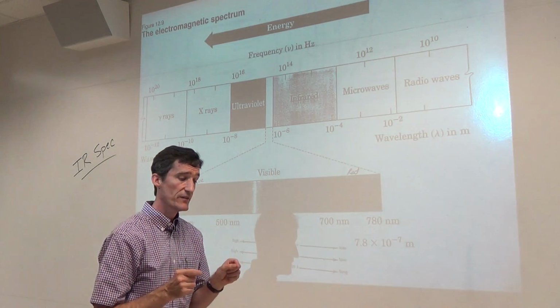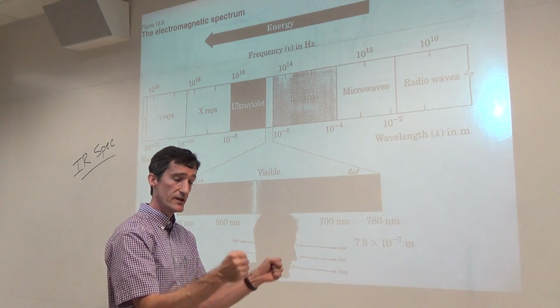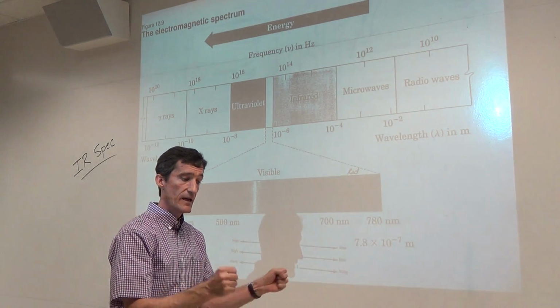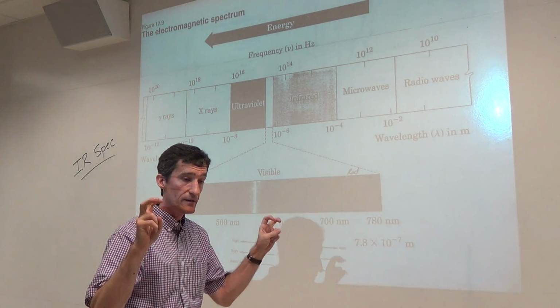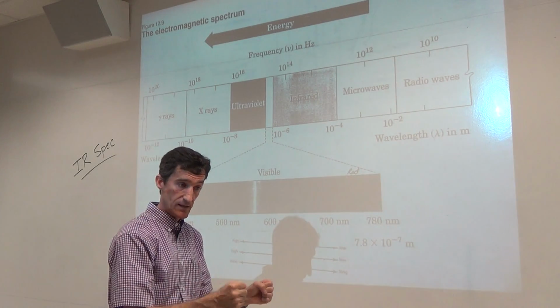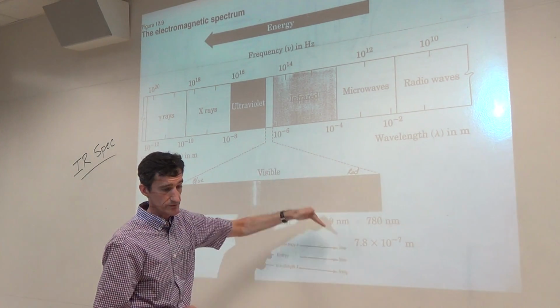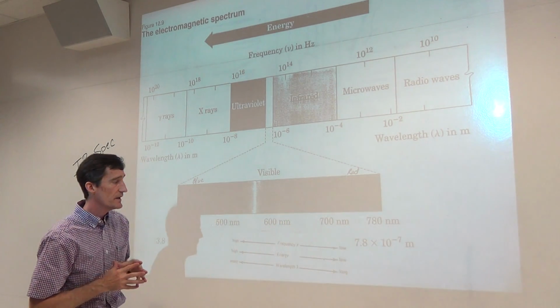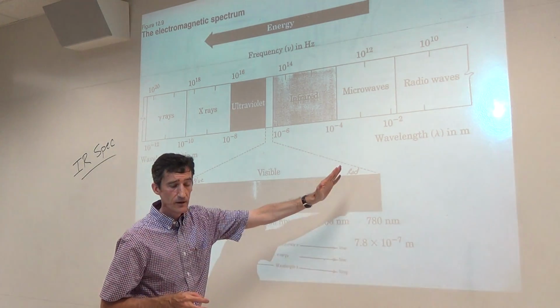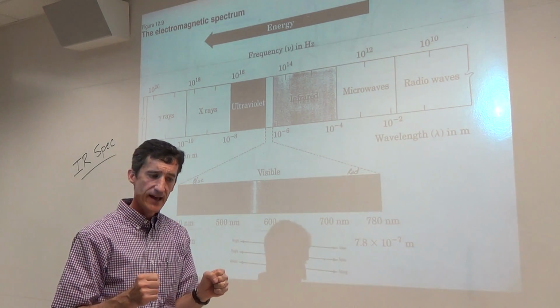It also turns out that if you shine IR onto a compound that's vibrating, that part of the molecule will absorb the IR light. And that's what we're plotting, absorbances in the IR. Now, why do we get so many peaks in the IR? Because there are so many types of frequencies that a molecule can have.